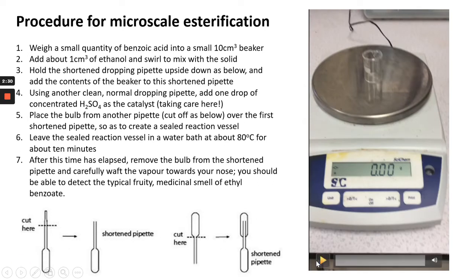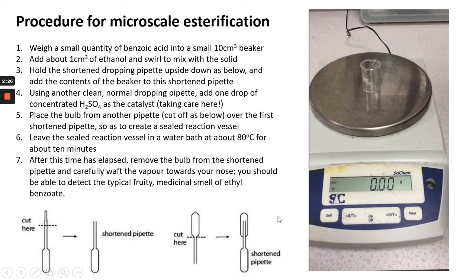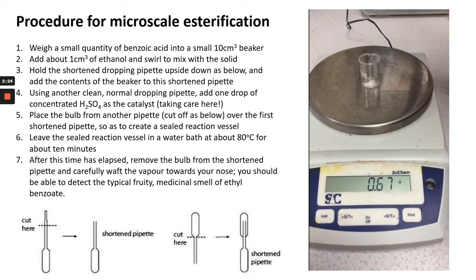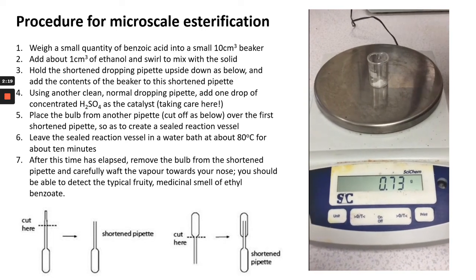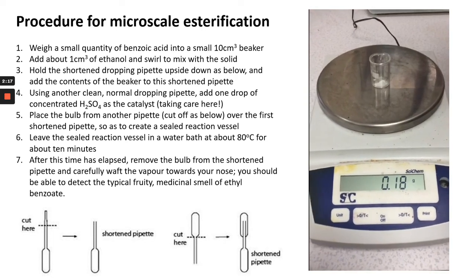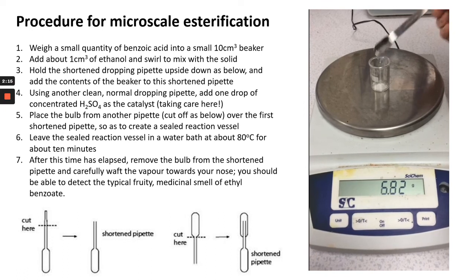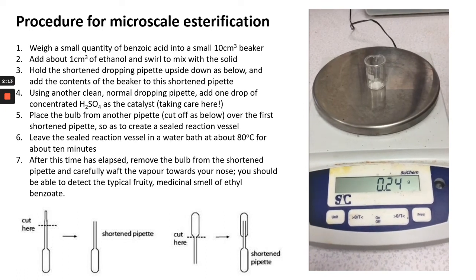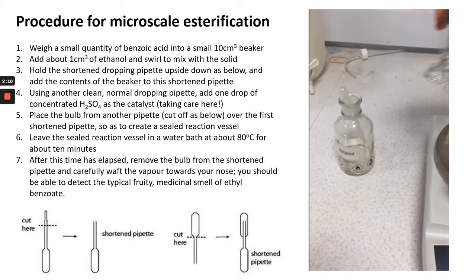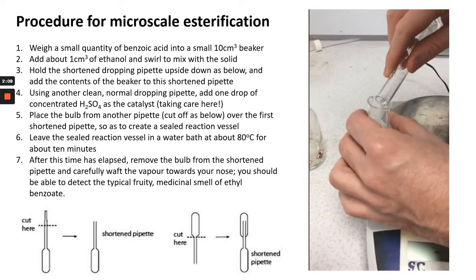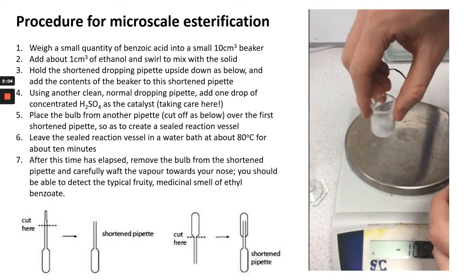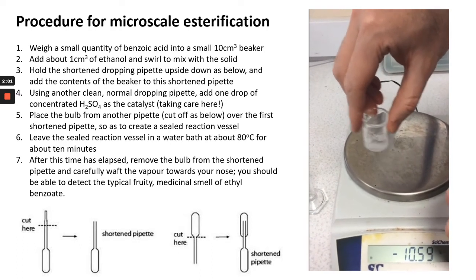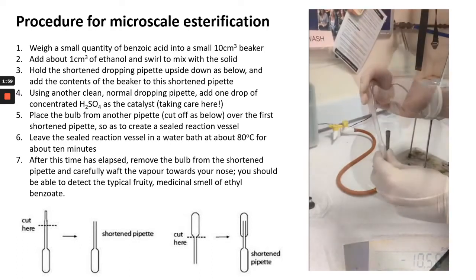My colleague Ollie is going to demonstrate, and I'm just going to narrate over what he's doing. He's going to weigh out approximately 0.24 grams of solid benzoic acid into a small 10 cm³ beaker. He's got about 1 cm³ of ethanol ready to add. Adding the ethanol directly to the solid benzoic acid, you give them a bit of a swirl and they mix together. Not reacting yet, because as we said, there is a high activation energy required to overcome.